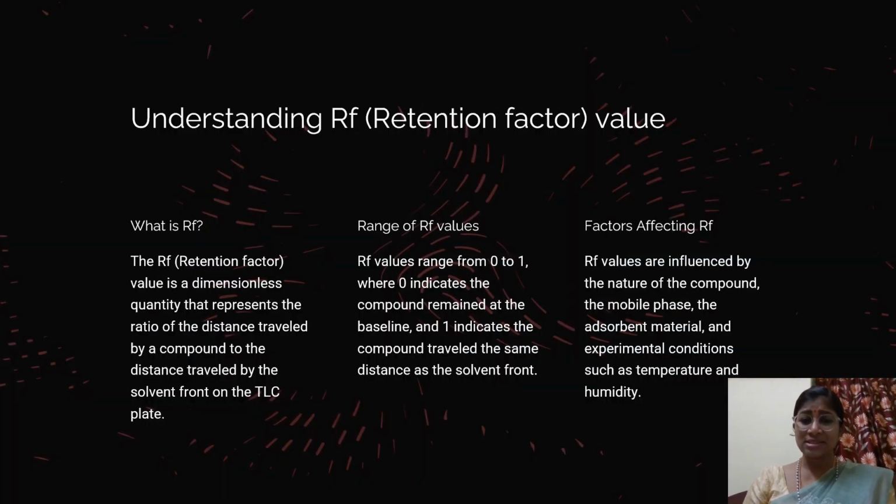So first we are understanding retention factor values. What is retention factor? Yes, the Rf. Retention factor value is a dimensionless quantity that represents the ratio of the distance traveled by a compound to the distance traveled by the solvent front on the TLC plate.